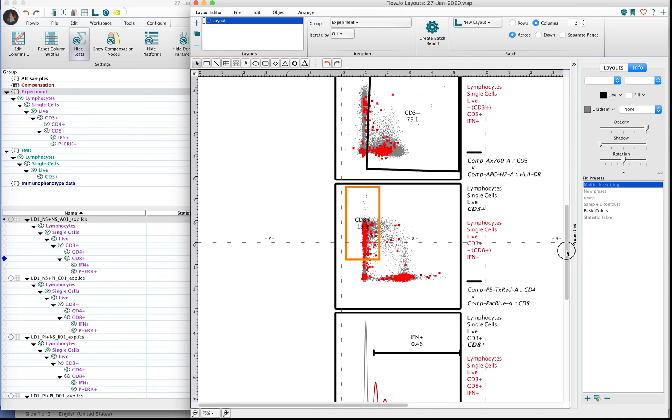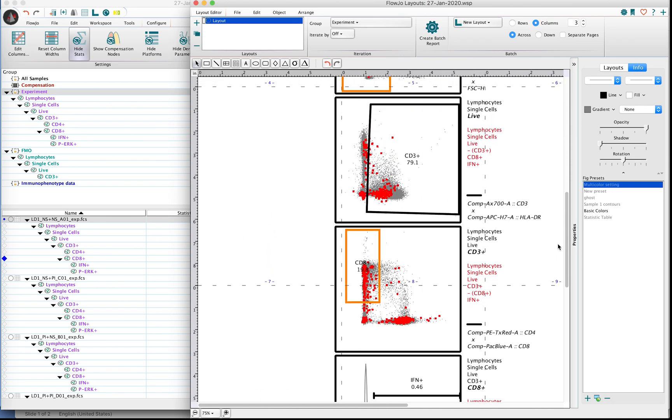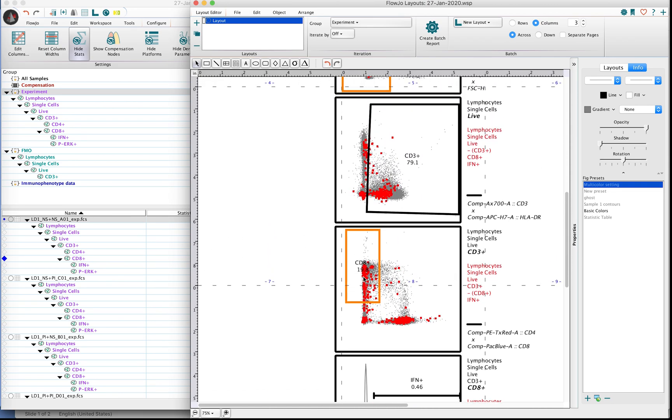So whatever is defining interferon positivity here is also defining interferon positivity in all previous steps. So as we move back, you can see all of the red dots that appear inside of our gates. These are interferon positive events that are being quantified in this terminal gate.